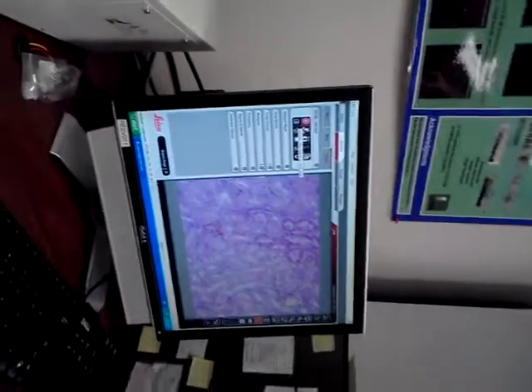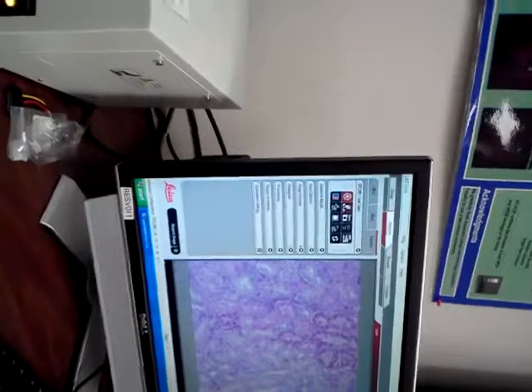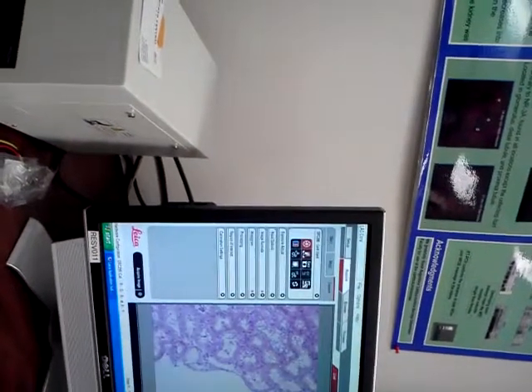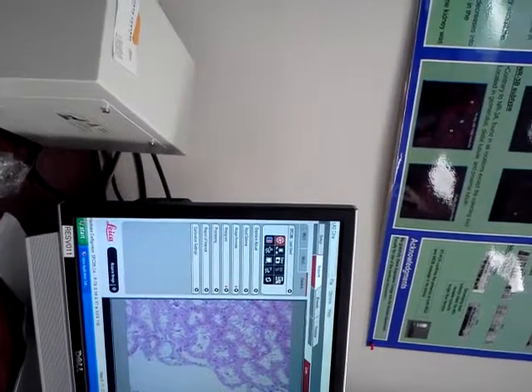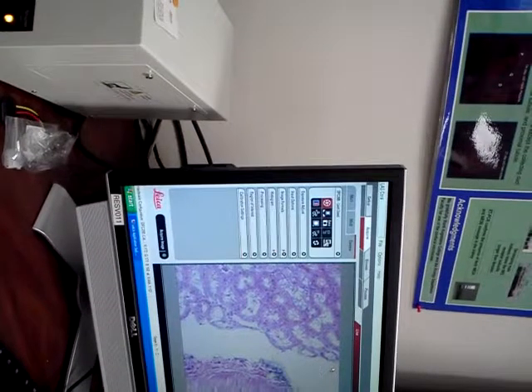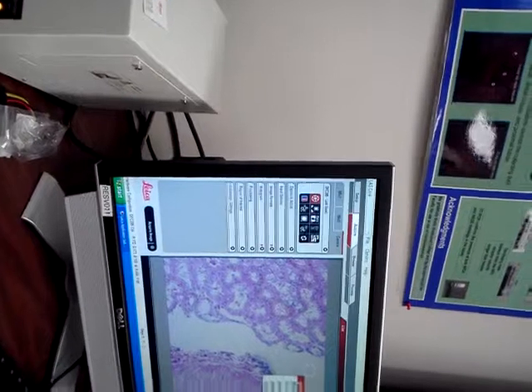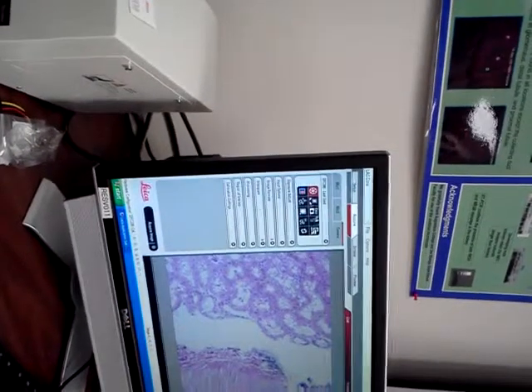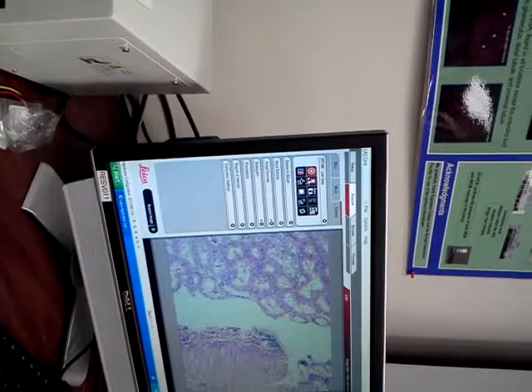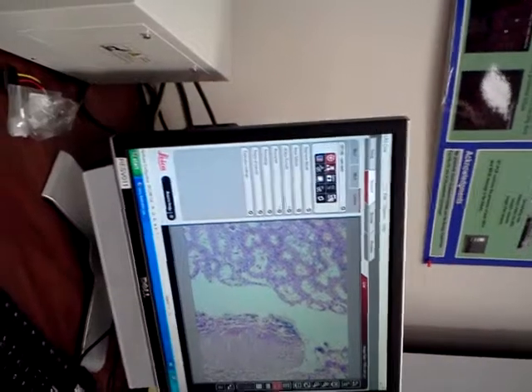The next one is your white balance, which I've already done. You can always do it. There's two ways to do it. You can go to an empty spot and just draw a box in the background and do white balance. All I'm doing is just left click, make a box, and I let it go and it pops up automatically for me. Okay. Or I can do a white balance on the whole image if you wanted to. It works better if you do the whole image if you're actually just in a white region.